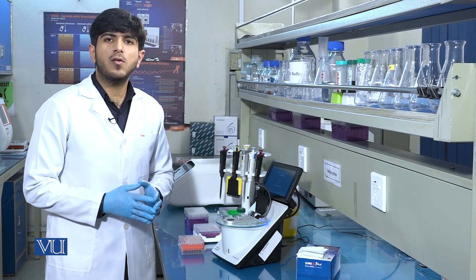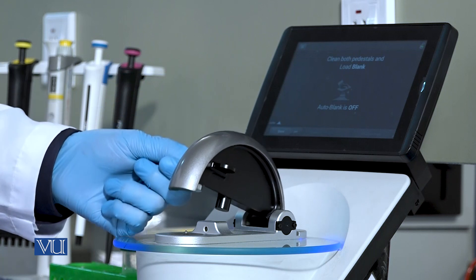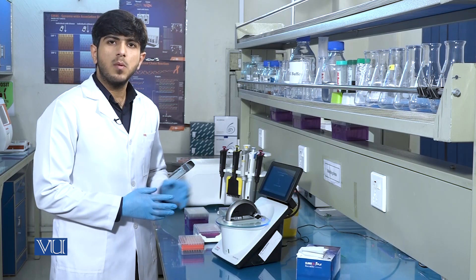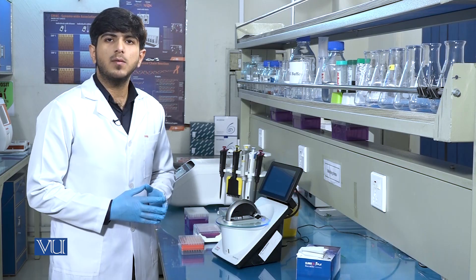After pouring 1 microliter of blank sample onto the tip, we will close the paddle of the NanoDrop and click blank. It will then start blanking.